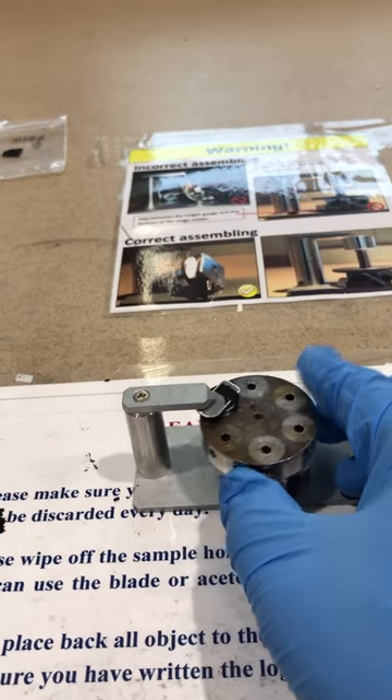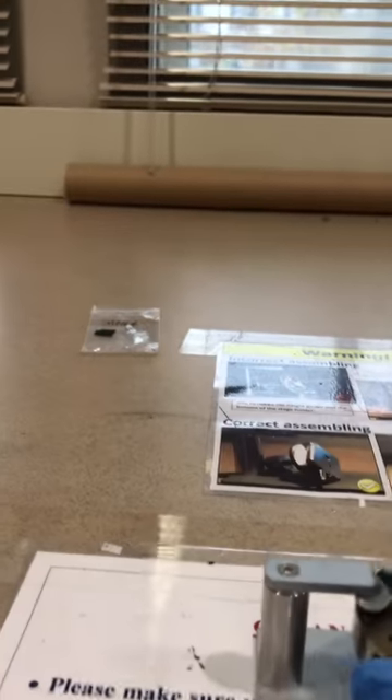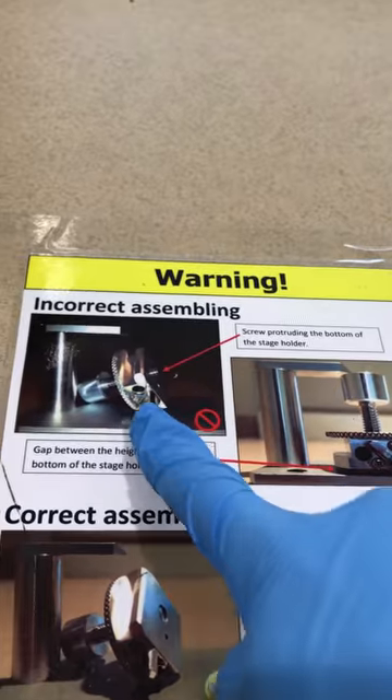After that, check the height and make sure you are not exceeding the height limit — otherwise you will hit the gun. Make sure any part of your sample is below this height.